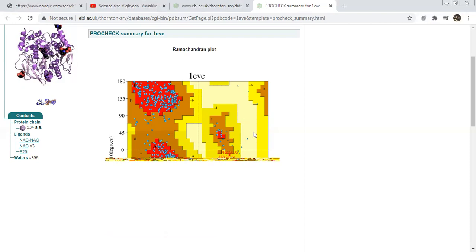Generally, whenever we look at any protein, we need to check the interaction of the ligand with the protein. It is expected that all the active amino acids that are helpful to make a bond with the ligand should be in the favorable region only. This is all about the favorable region — the yellow mark.